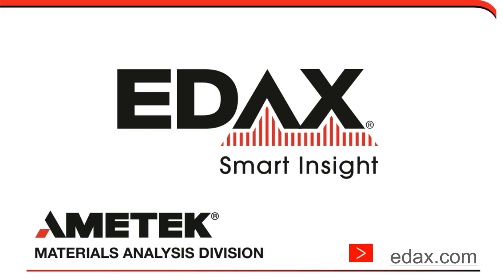and then if you need more resolution, go to TKD, transmission Kikuchi diffraction, which we also have some presentations and webinars on, so look at that for going to higher resolution or to smaller grain sizes. I do make the point that while we can image a small grain, say a 50 nanometer grain, if you're going to do any type of strain work, then you're going to need enough measurements within the grain to get at the strain fields and capture those local misorientation changes. So you may not be able to do 50 nanometer grains, and while you can image them, you may not be able to capture the strain within those.